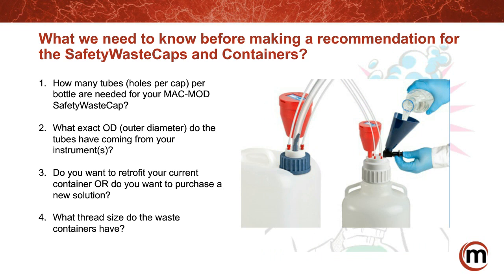As I said before, there are questions you might want to consider with your safety waste caps as you would with your safety caps. Very similar questions, but how many tubes per bottle are needed? It's very common to have multiple instruments flow into one waste container, so it may be necessary to implement an adapter, like I showed before, to allow for more tubes.